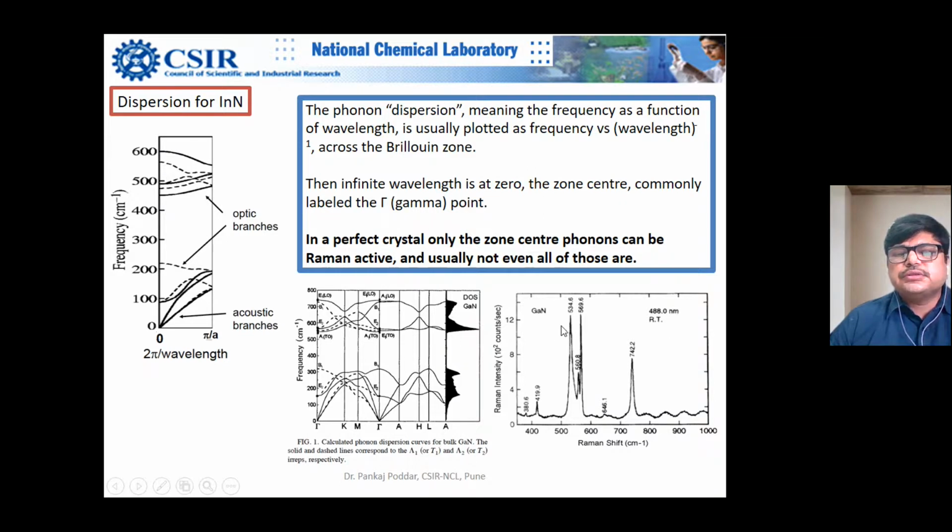So this is for gallium nitride. These are slightly shifted. And this is for indium nitride. But you do not get these values actually. The reason is the source. We are taking a visible light source mostly in Raman, and if we put the wavelength here, which is typically 500 nanometer, 600 nanometer, this K value becomes almost close to zero. So you have to increase K.